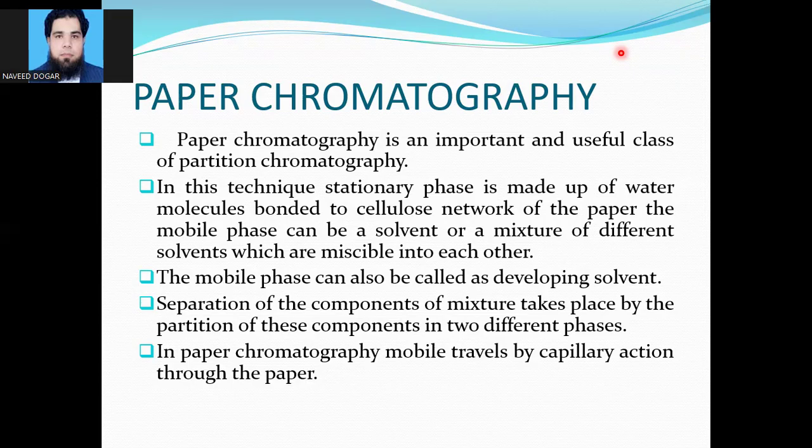Now, today I'm going to deliver a lecture on paper chromatography. It's a very important type of chromatography, and we will discuss this topic in detail. Basically, paper chromatography is an important and useful type of partition chromatography.